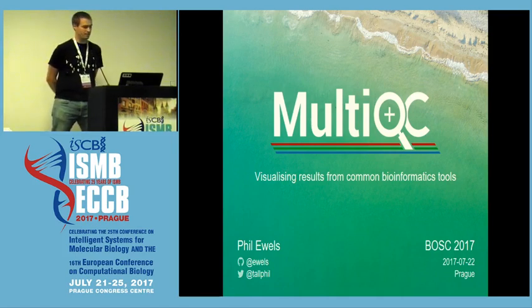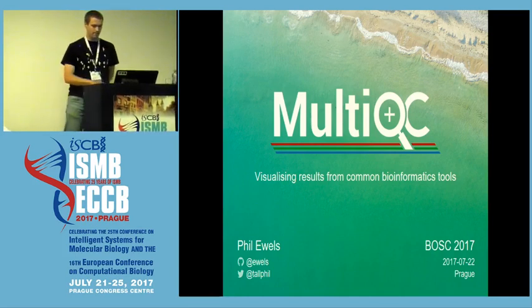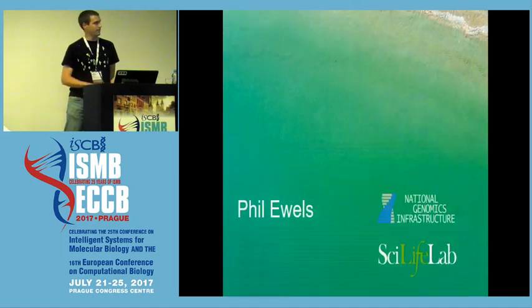And I'm going to talk to you about MultiQC, which is my visualization tool. We've converted this from Keynote, so we'll see how it goes.